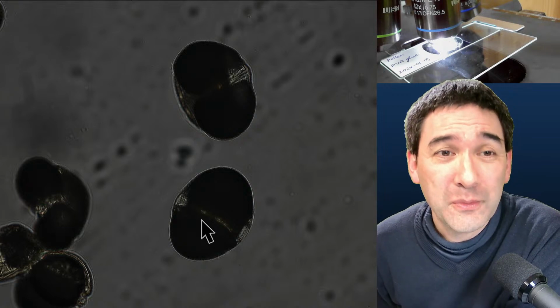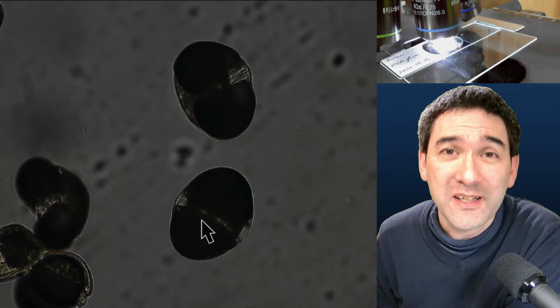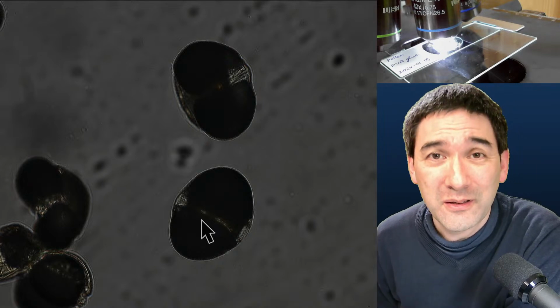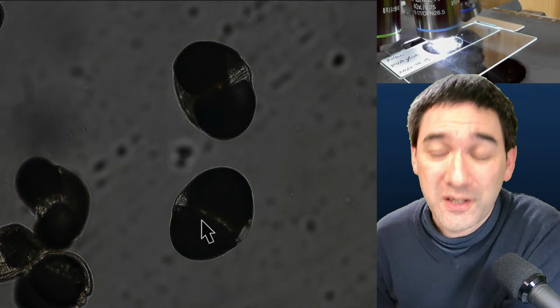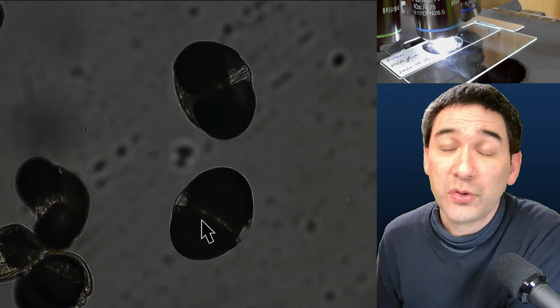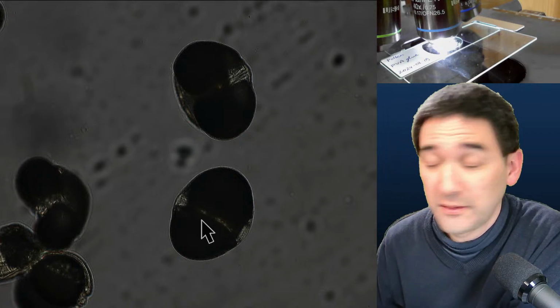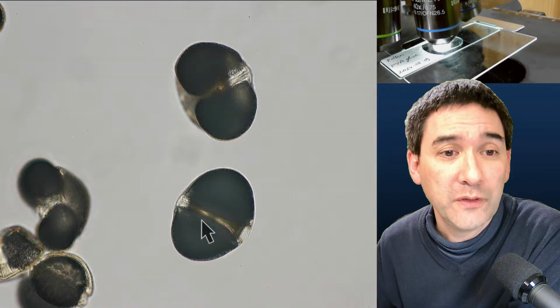One would have to see if decreasing the refractive index between the crystals and the surrounding medium actually improves something. Mineral oil you can try to use, or kitchen oil, or even immersion oil can be used as well. But I forgot to flip up the condenser here.